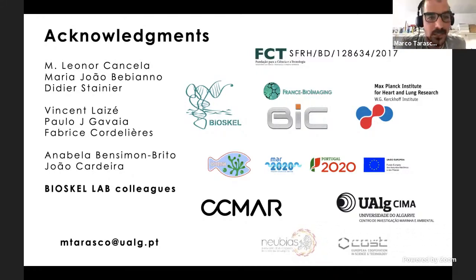We just need to maybe add or cut some steps, but the main processes are normally similar. So the same macro I used to count neutrophils, I also use to count, in another case, microplastic particles or other things. So sometimes they can be adapted and applied for many, many things.